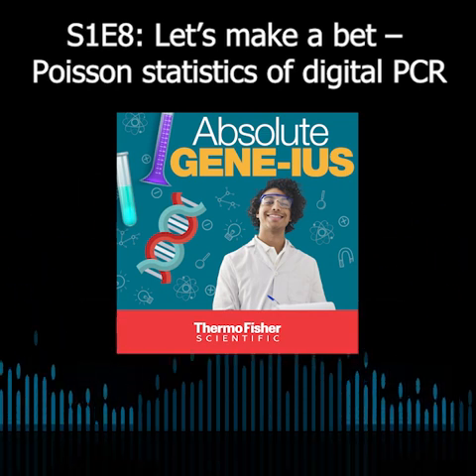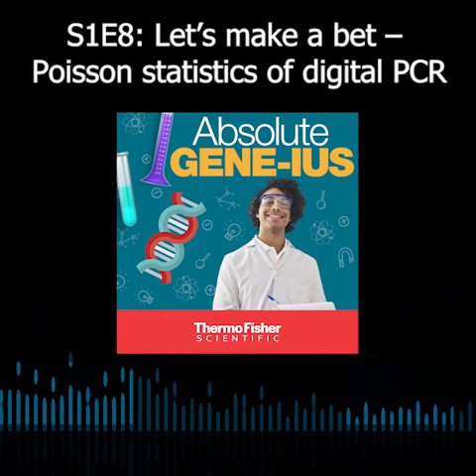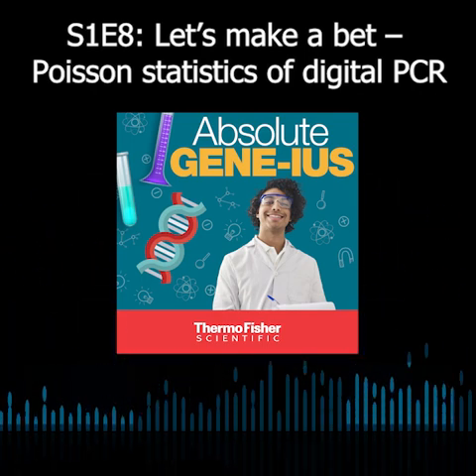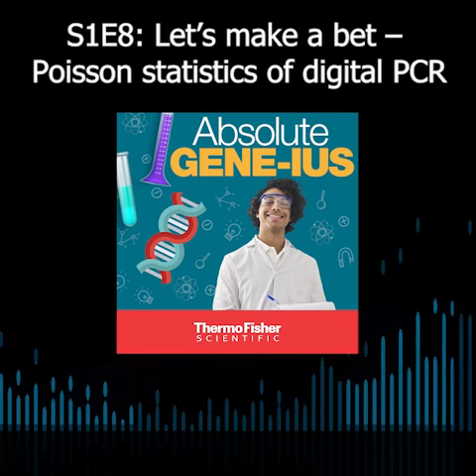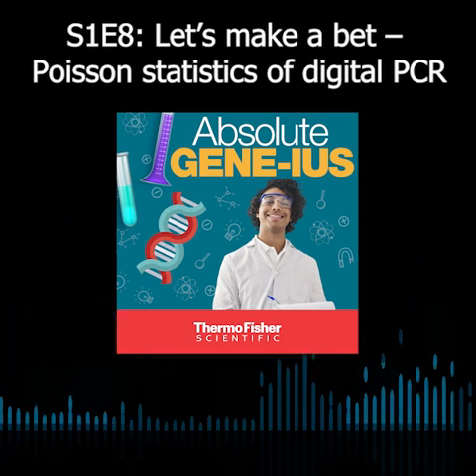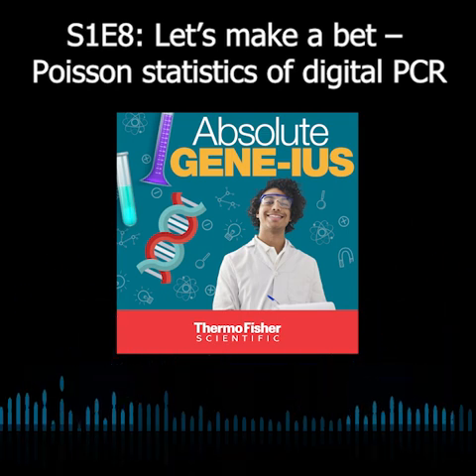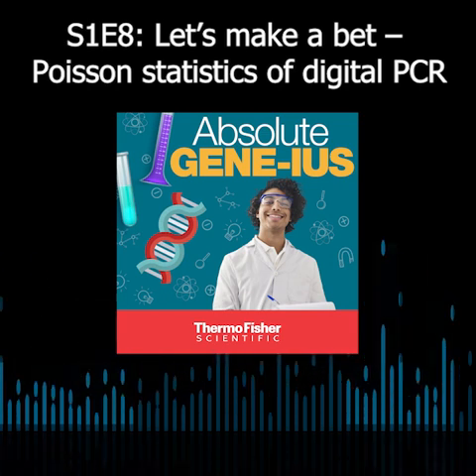In terms of the actual micro reactions and micro chambers, is there a number that is statistically important to use to get you the most precise data? So there's no magic number where if you say you have above this value of chambers that you are safe. It truly is just continuous, more is better. And the big change when you have more chambers, you get a bigger dynamic range, meaning you can measure concentrations across a wider range of values.